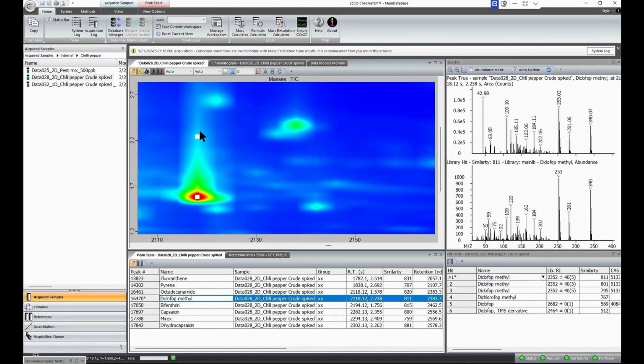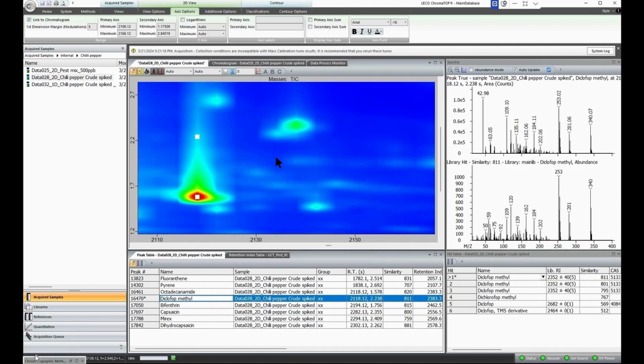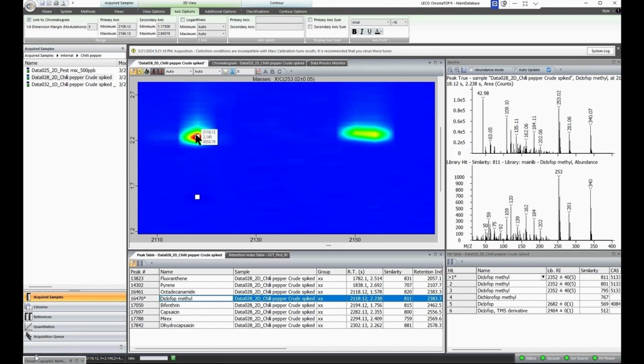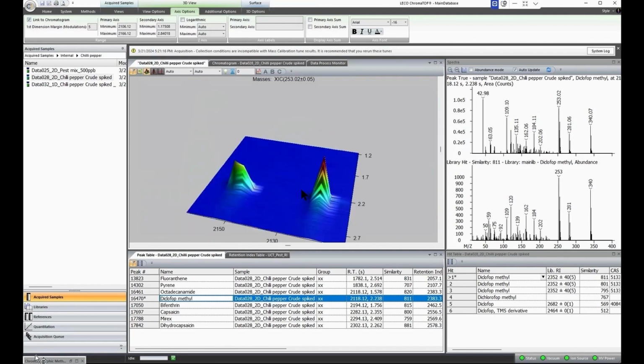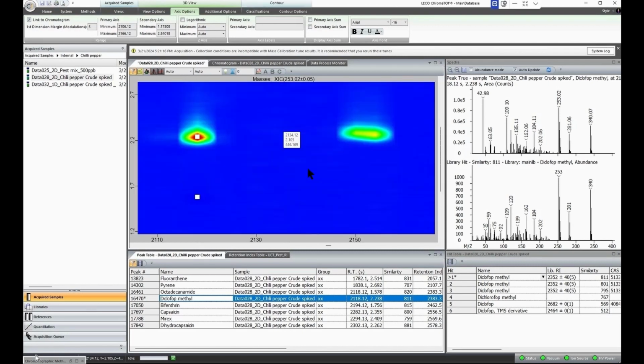Maybe we see just some small spot in here, but it's lost in the interferences. But as soon as we click on this peak marker, we see that another pesticide has been identified, called diclofop-methyl. Even in this case, that's the deconvoluted mass spectrum, and that's the library spectrum from the NIST library. Good matching score, and typing a selected mass for such component, we see how the selectivity of such a method is able to pull our peak out of the matrix, giving a perfect peak shape and identification confidence in what we do.